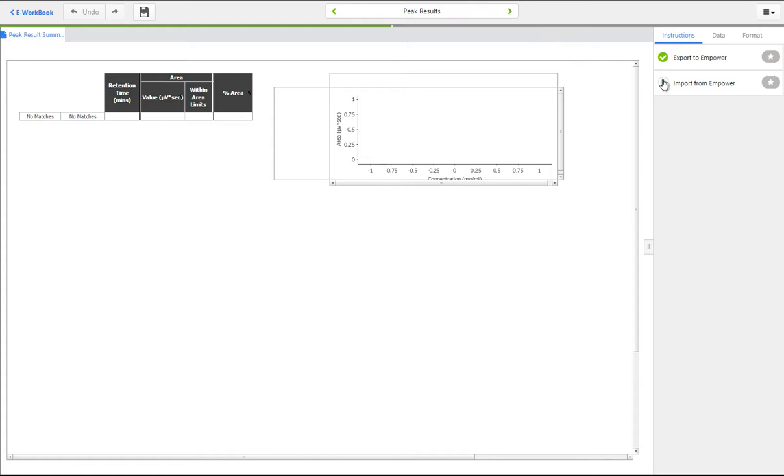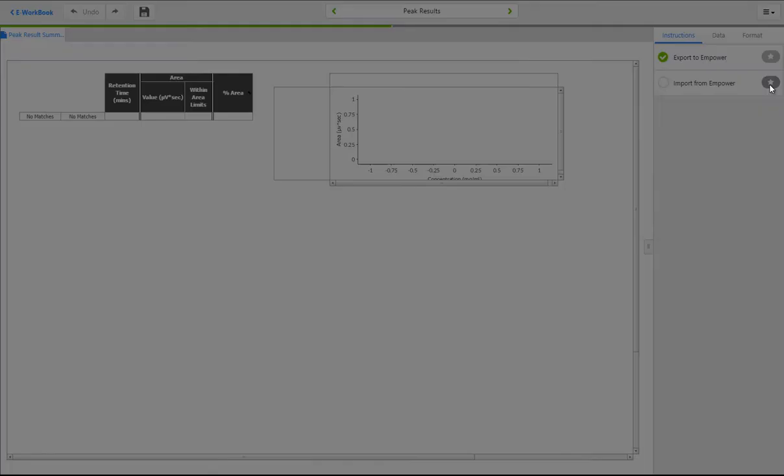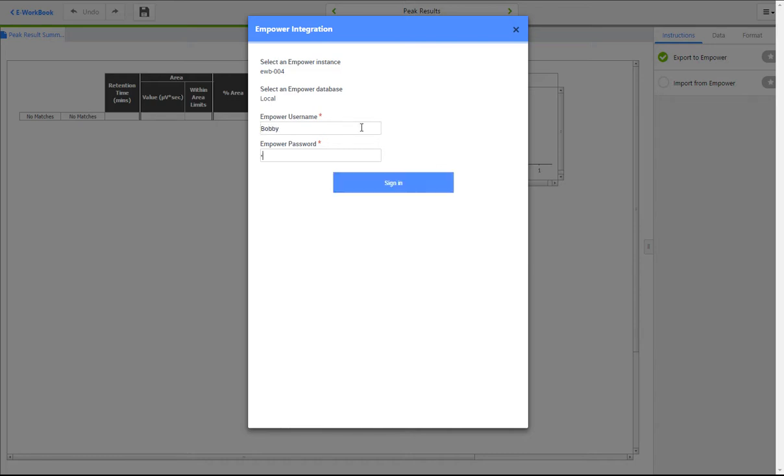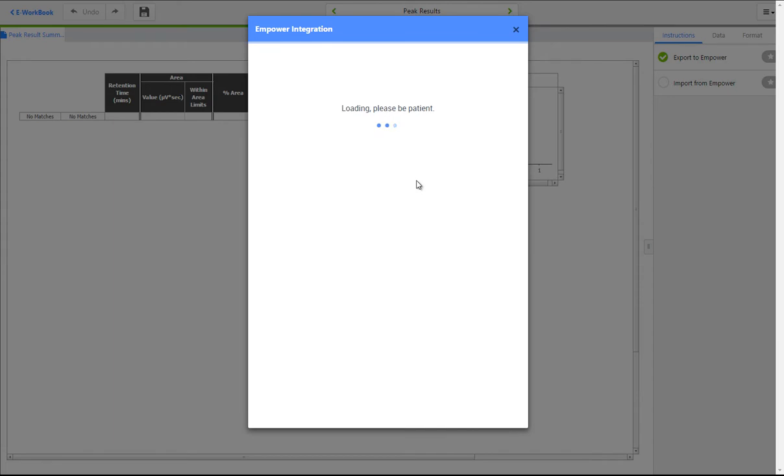The import of data is also performed using spreadsheet instructions. You will need to sign into mPower to proceed. If required, some of this information can be hard-coded in the integration definition files to streamline this process.